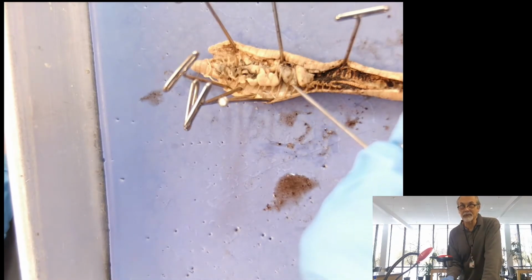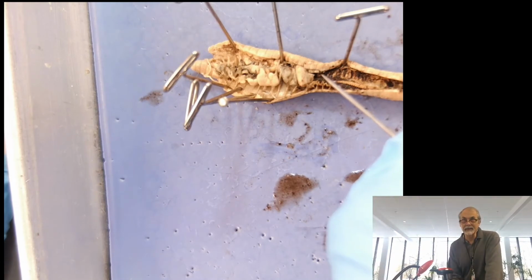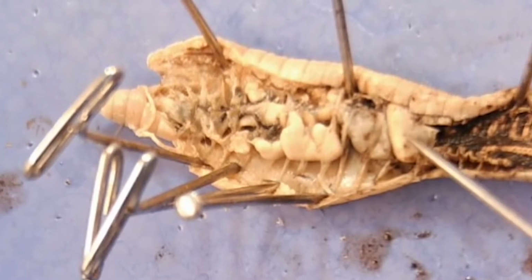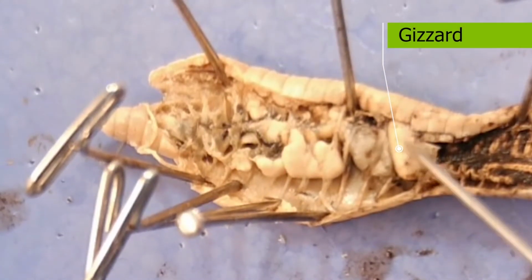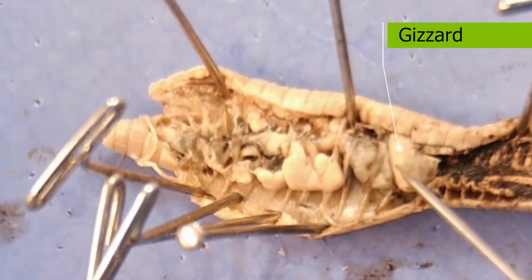And the chicken, of course, they use pebbles or small stones. And again, as the muscular walls of their gizzard contract, the pebbles or stones grind up the food. Okay, again, they don't have teeth, so they can't use typical mastication to do that. So again, the gizzard is a thick-walled muscular structure. As sand moves into it, that they ingest along with other food particles, the contractions of the muscle force those sand particles together and grind up the food.